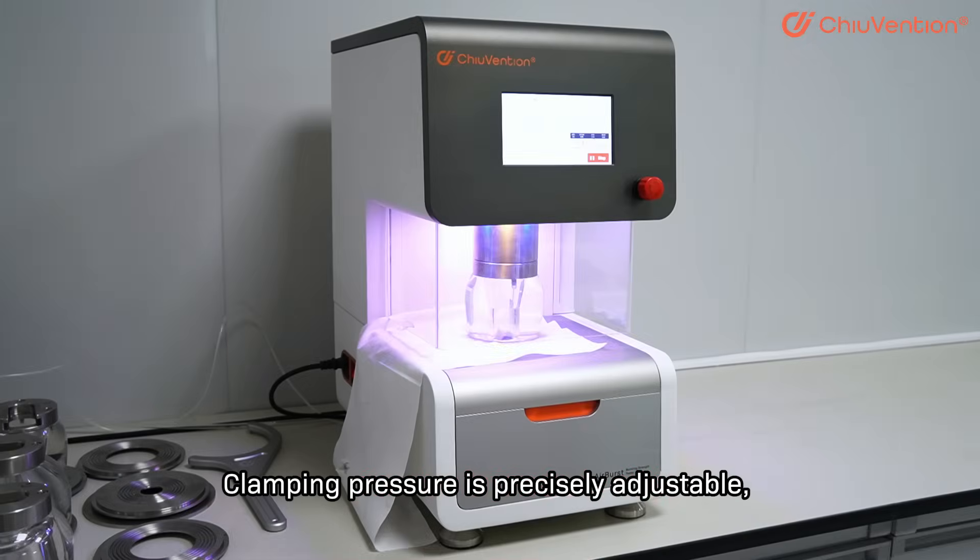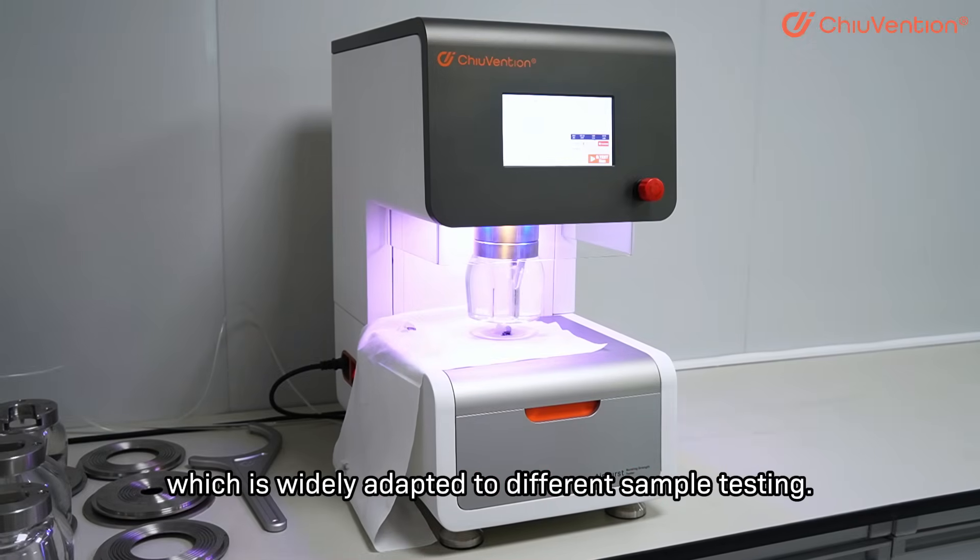Clamping pressure is precisely adjustable, which is widely adapted to different sample testing.